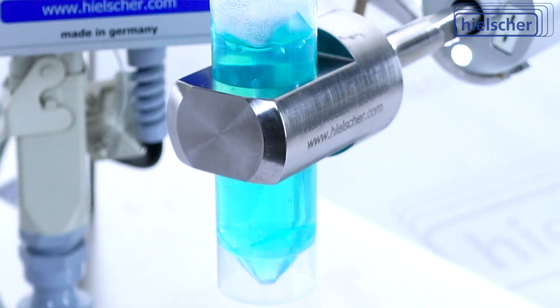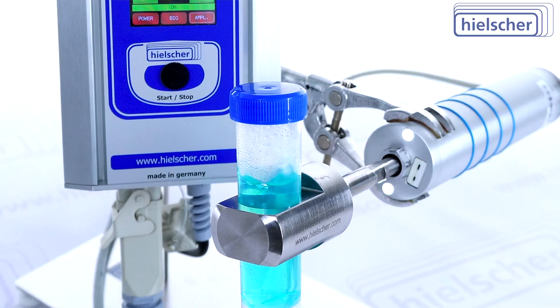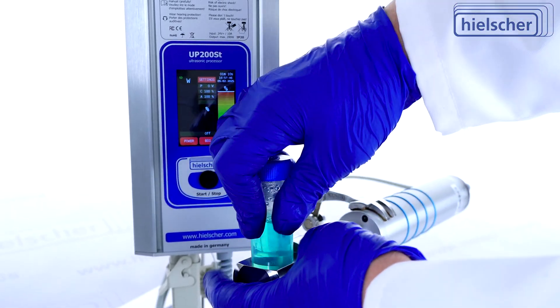Meanwhile, the falcon tube's polypropylene construction supports a wide range of solvents, buffers, and reagents, making the system versatile and easy to integrate into existing laboratory protocols.